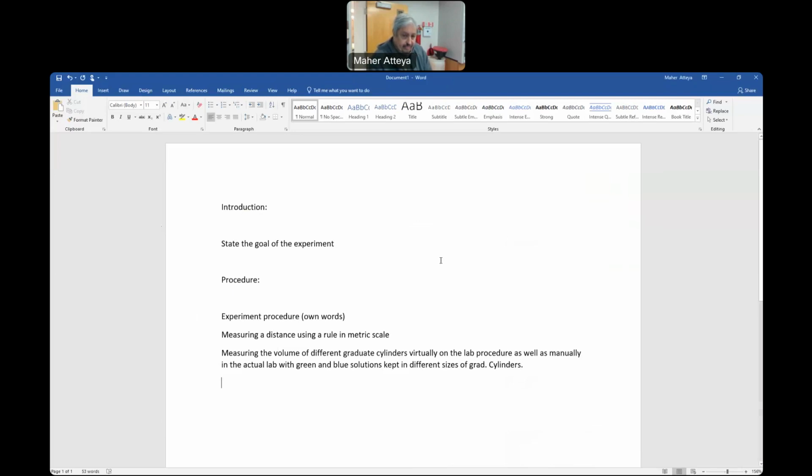We did using the distance, different. And then we measured the scale here, correct? The distance scale, as well as the volume here. We did manually, and we did virtually when we measured the rectangular depth, length and height. So then you can measure the mass, correct?